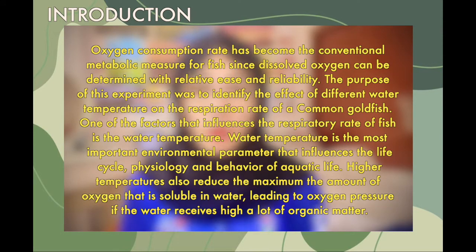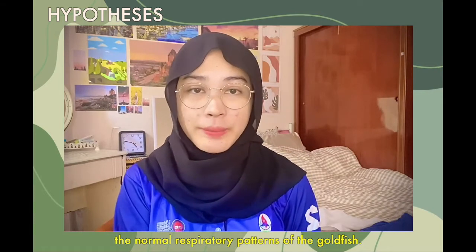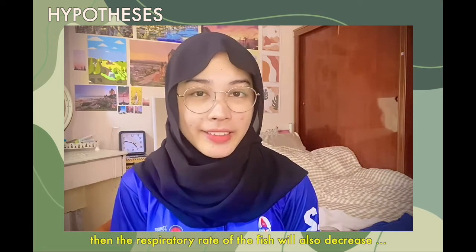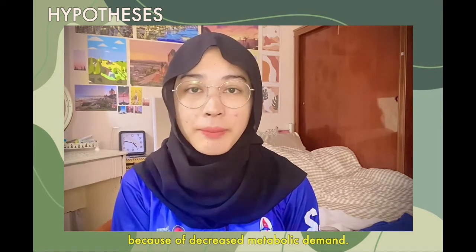Water temperature is the most important environmental parameter that influences the life cycle, physiology, and behavior of aquatic life. High temperature also reduces the maximum amount of oxygen that is soluble in water, leading to oxygen stress if the water receives a high flow of organic matter. A change in water temperature will affect the normal respiratory patterns of the goldfish. If the water temperature decreases, then the respiratory rate of the fish will also decrease because of decreased metabolic demand.